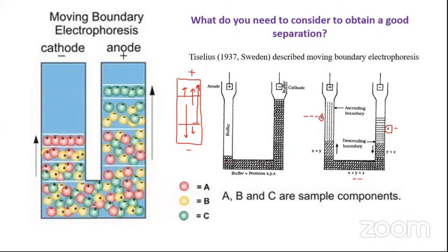See, look at this arrangement. It has been purposefully drawn and arranged like this, so that every molecule gains a negative charge only and is made to move towards the anode, so that I can place a detector here and monitor the movement easily by using a single detection system. How can I ensure that this happens like this? Come on, it's quite easy.